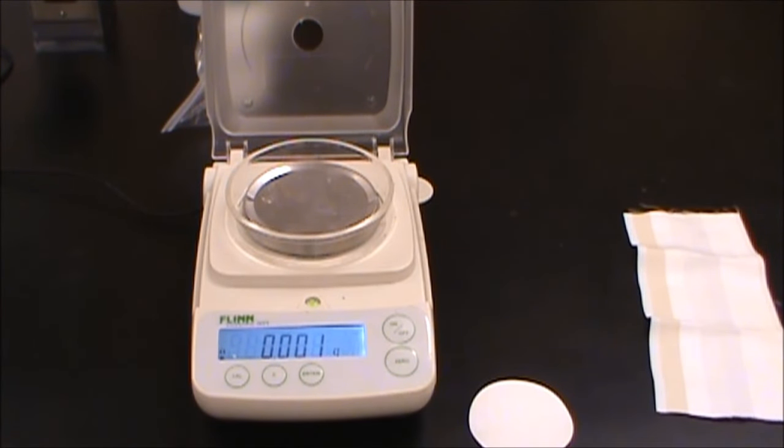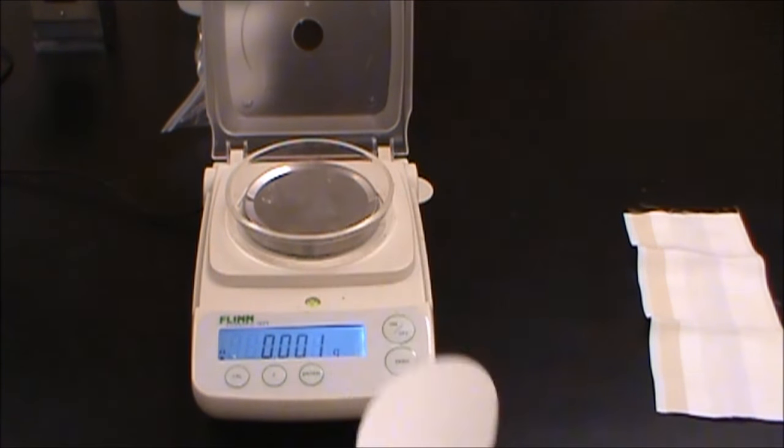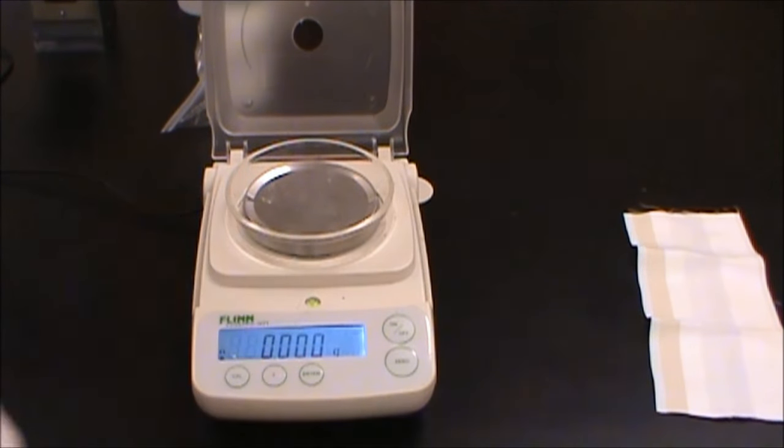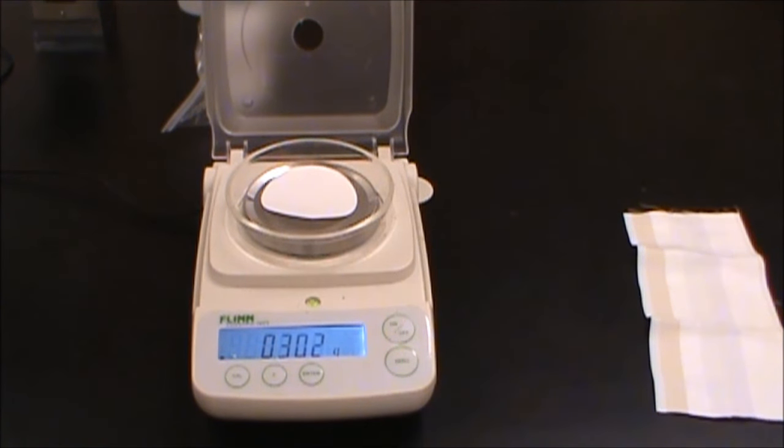So now our mixture is just getting done with going through the reaction. What we want to do now is we want to filter out the indigo. So before we do that, since we're doing a quantitative, we're going to go ahead and get the mass of our filter paper while dry. And then write that down, 0.303 grams.